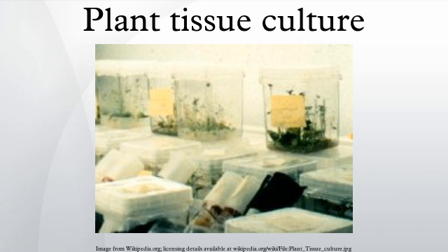Plant tissue culture relies on the fact that many plant cells have the ability to regenerate a whole plant. Single cells, plant cells without cell walls, pieces of leaves, stems or roots can often be used to generate a new plant on culture media given the required nutrients and plant hormones.